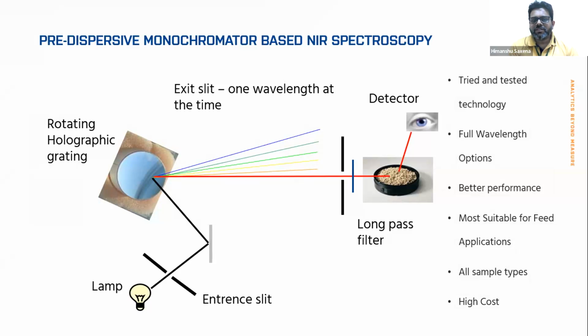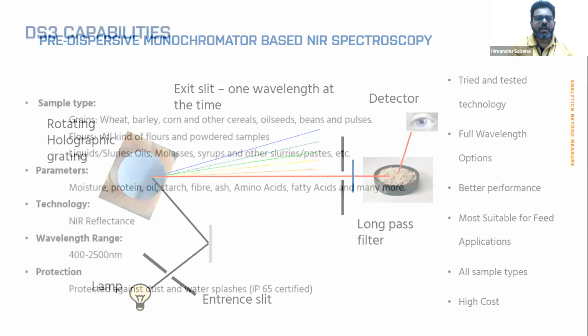So this is how the instrument works. And then, again using a calibration model and algorithm, the results are expressed in a layman-understandable unit, be it a percentage value or whatever is the parameter accordingly.